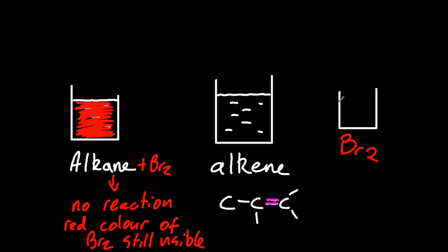Well, let's have a look for an alkene, allow me to fill this up. There is a mountain in Indonesia called Mount Bromo that smells really bad, too. Oh, well, that's funny. You pour that in there, and the red colour's gone. It has been decolourised.